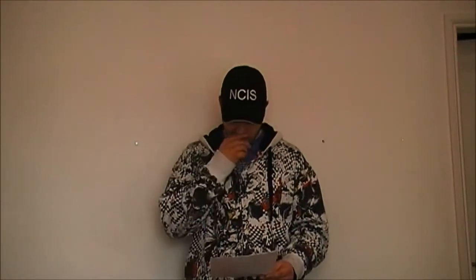The highest mass ion in a spectrum is normally considered to be a molecular ion, and lower mass ions are fragments from the molecular ion, assuming the sample is a single pure compound. Since a mass spectrometer separates and detects ions of slightly different masses, it easily distinguishes different isotopes of a given element. This is most noticeable in compounds containing bromine and chlorine, however there are many other elements with different isotopes. An example of boron is given on the sheet.